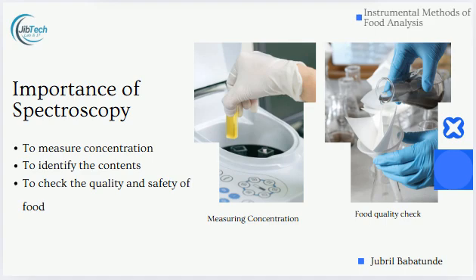It can tell us the concentration of substances, like the cup of juice analogy I gave earlier. It can give us the concentration of vitamin C in our juice, just by shining a particular source of light on the juice in the cup.